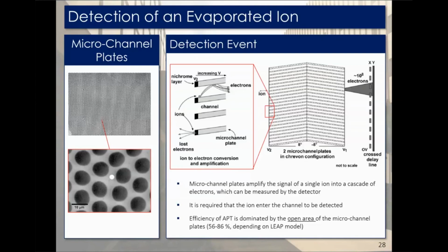So we can expect that there's not going to be any discrimination between which atoms on the mass spectra are picked up and which of them aren't, and therefore our composition measurements and so on should all still be okay and affected uniformly. We do, however, have to keep this in mind when we go to the reconstruction stage, because we have to account for the lost volume of these undetected atoms.